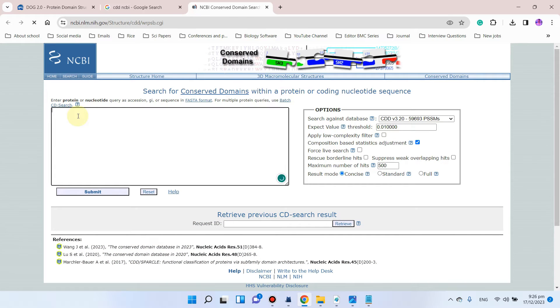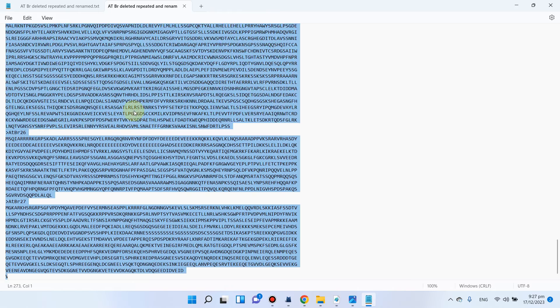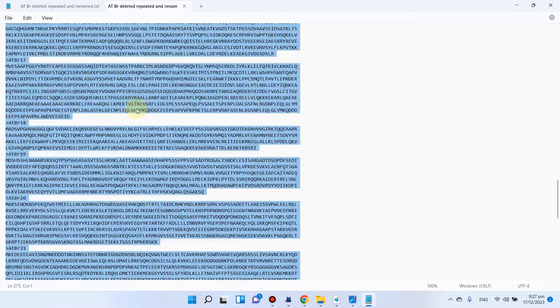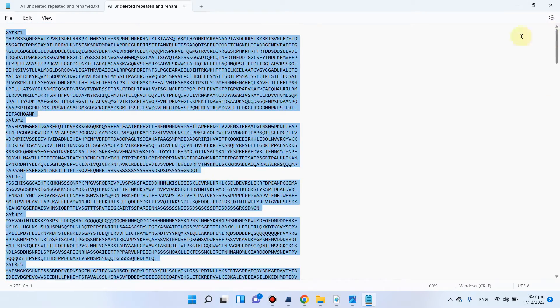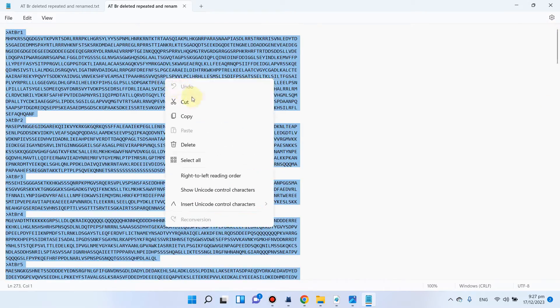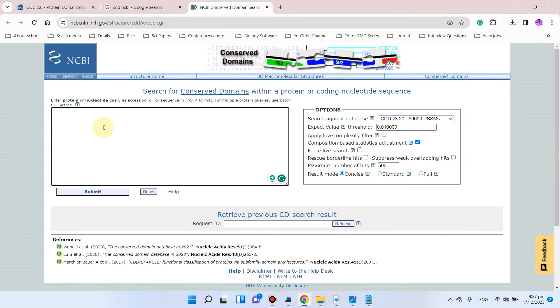Here you can paste your protein sequences to find conserved domains. We want to find domains for the Arabidopsis genome sequences we created in our previous file. We simply copy those sequences and paste them here.